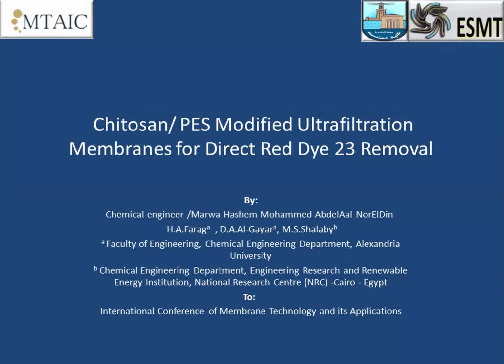I'm going to share our research, which is about the addition of Chitosan to an ultrafiltration membrane and using it for the removal of direct red dye 23, especially.